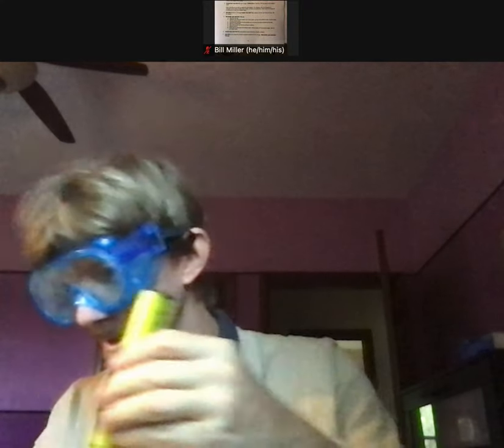Now I'm going to hit the CAL button again. It says 4.01 blinking, then it says 'end' — that means I'm done. When it comes back on it reads 3.95, which for us is close enough. Now I'm going to rinse it again.